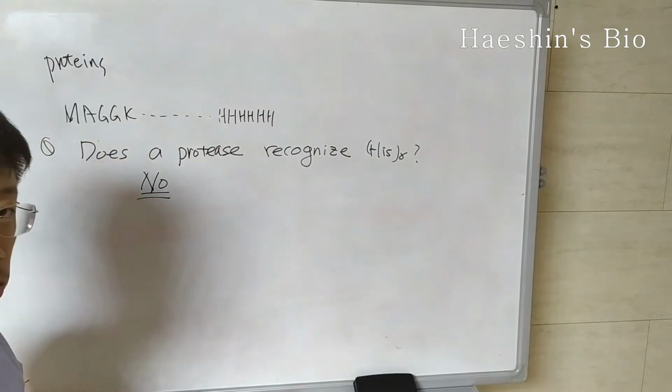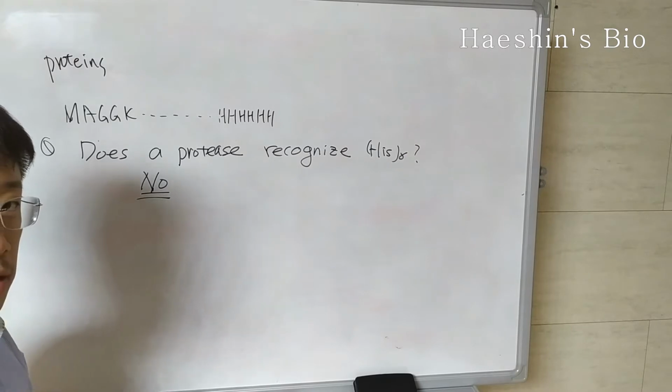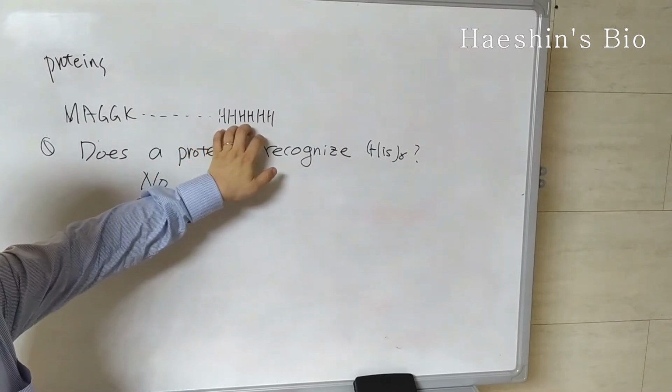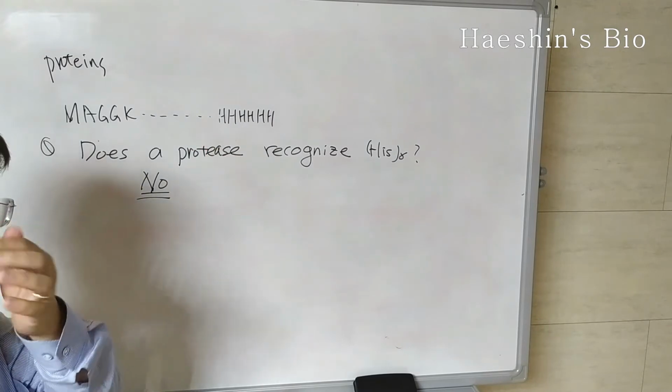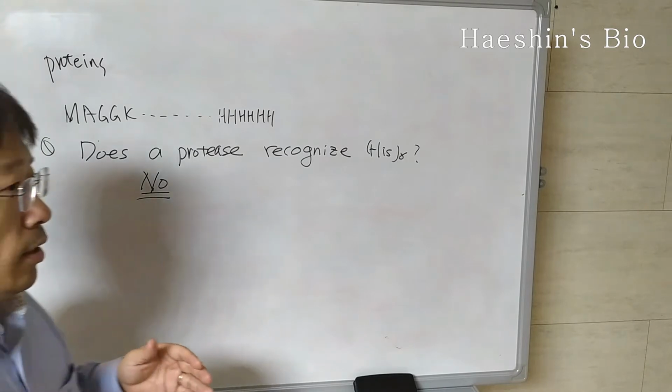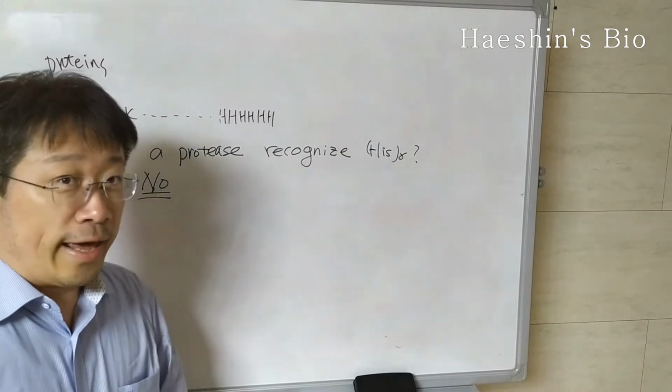So you have to actually use another recognition sequence for removing the histidine tag. This is a big task for protein purification. That's why it's often preferred not to use a histidine tag.